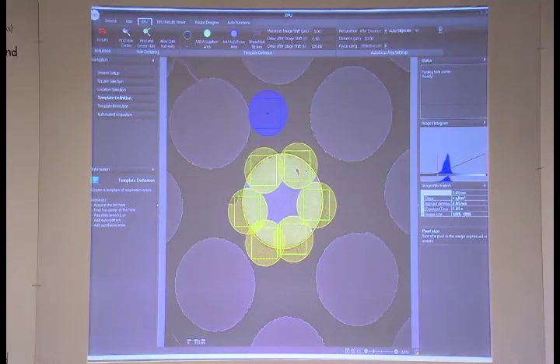On the old microscopes we could basically just shoot one shot precisely, but because of the stability of our current microscopes we can do this kind of mechanism of acquisition. So the square here is where the picture will be taken, and the round bit is the size of the beam. So we position a little bit on the carbon just so we get a nice stable image and reduce the amount of drift that we have from our images.